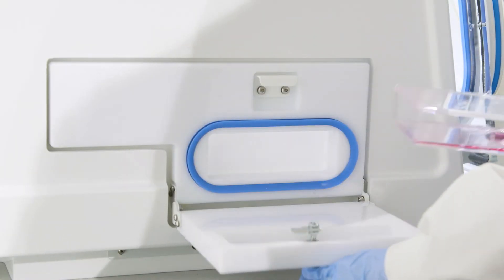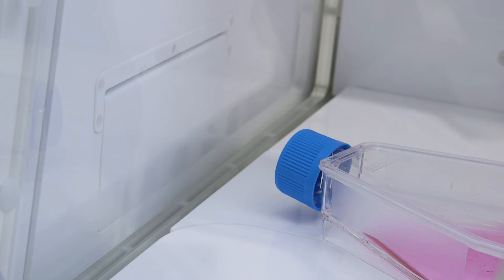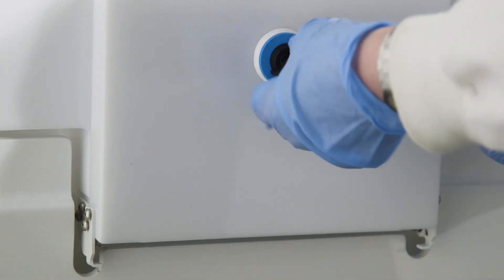A side loading letterbox entry system is also available, providing a straightforward way to quickly introduce individual flasks and pipettes into the workstation.